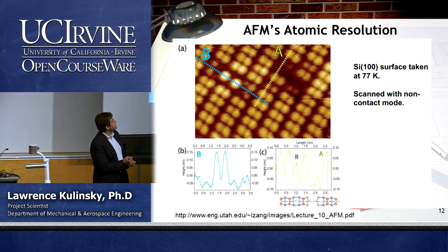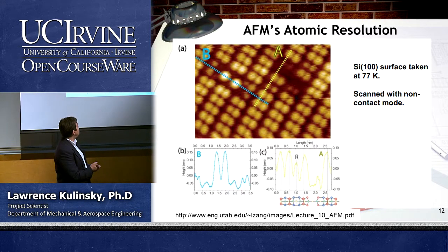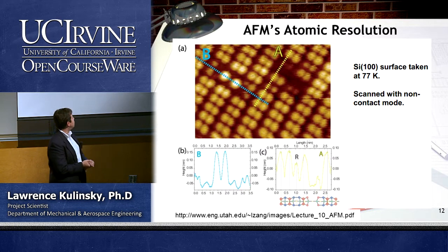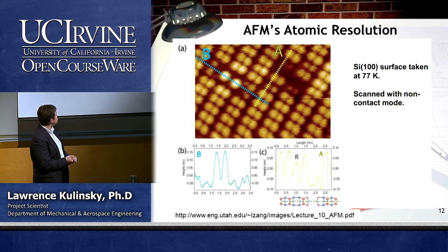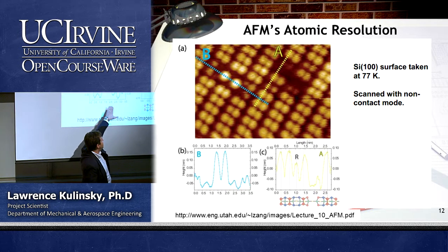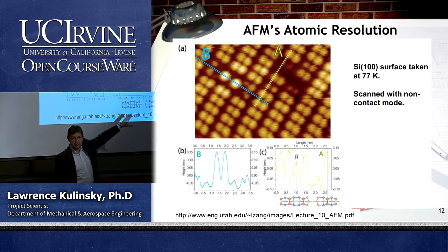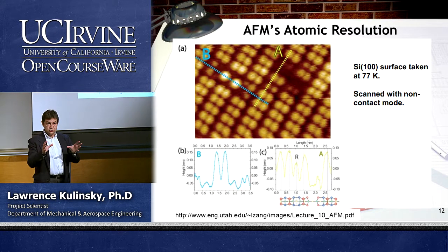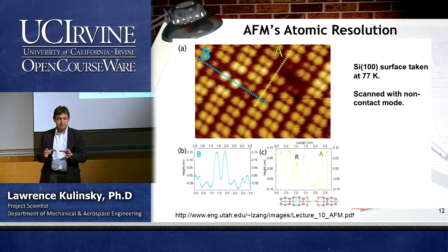So here is the typical picture of AFM. It's 100 silicon surface, and it is scanned in non-contact mode. So you can see here the profiles, okay, in 2 different directions. So you really can resolve individual atoms.